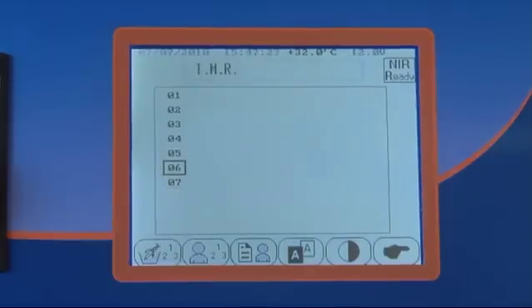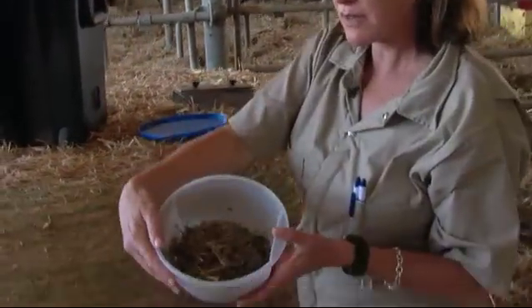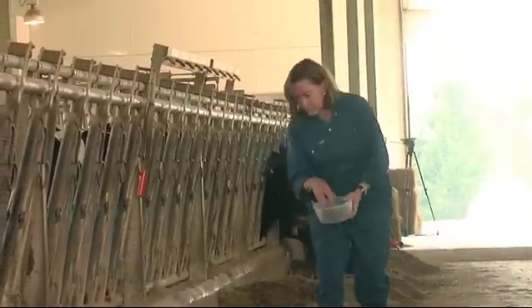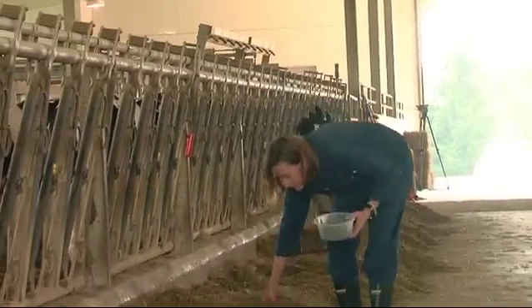Today we're going to do an analysis of a producer's TMR. That's the sample that was taken down through the bunk at early feed-out, middle feed-out, and at the end of feed-out.